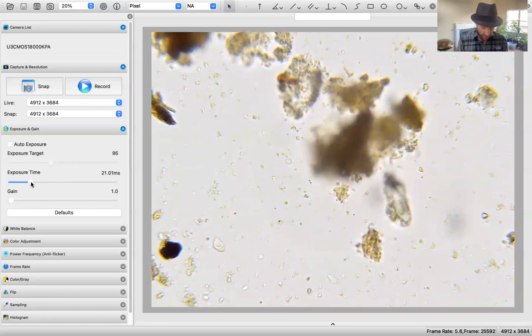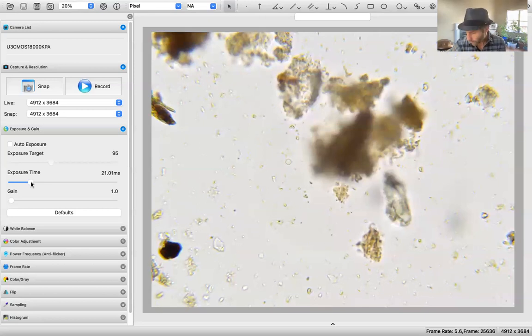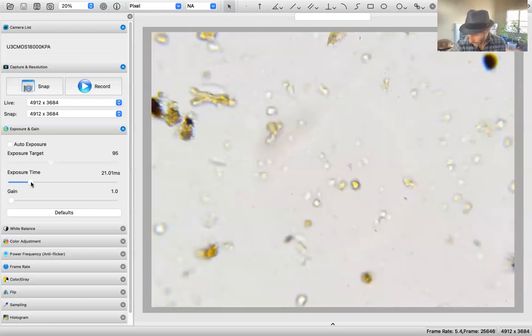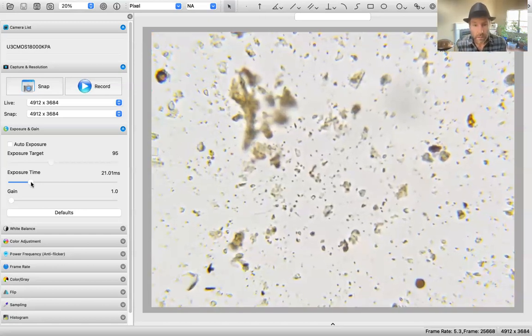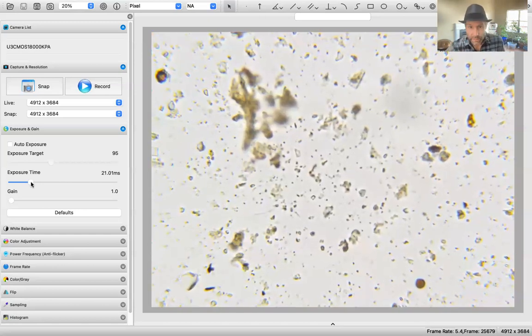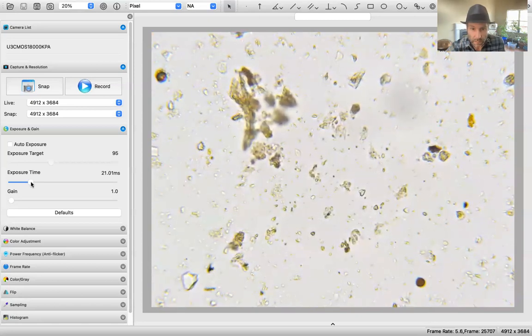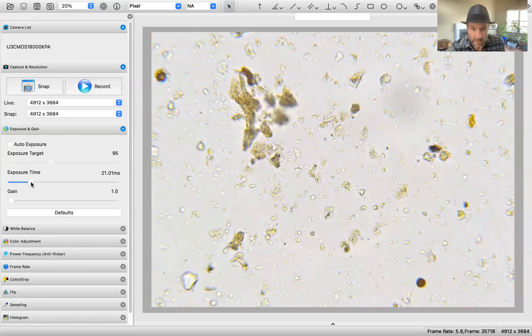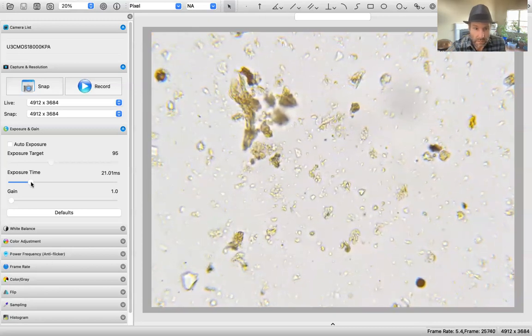So what we're going to be doing here is starting in the upper left. We're going to move to reading area 1, and there we have it. All right, let me get you in focus. Looks like a little actinobacteria right down there.